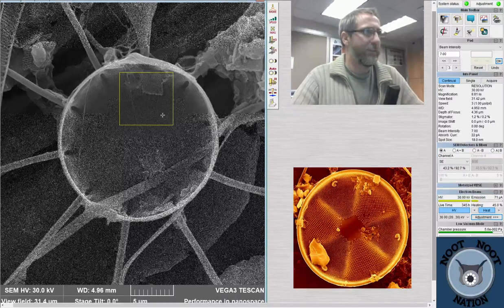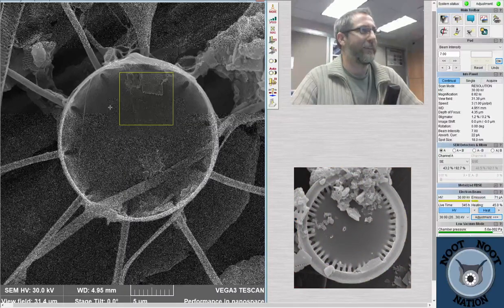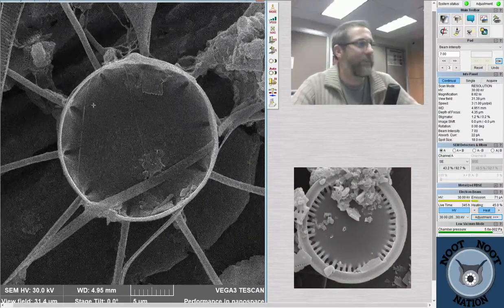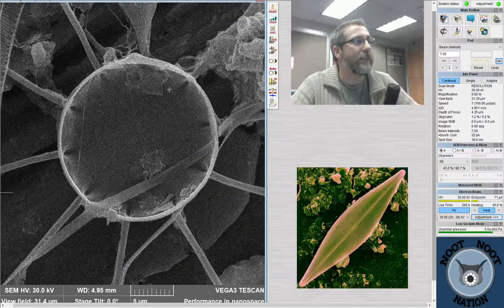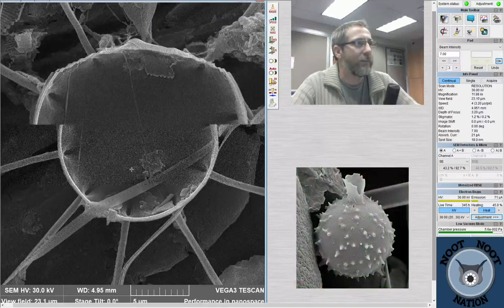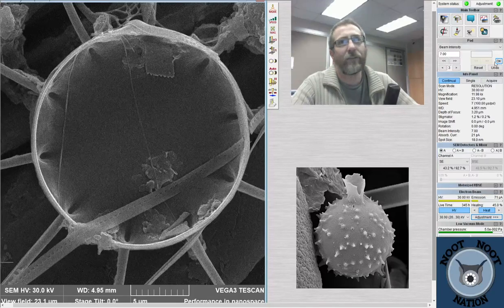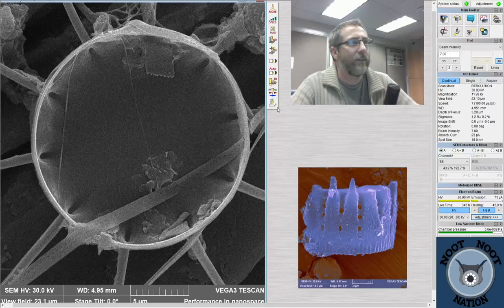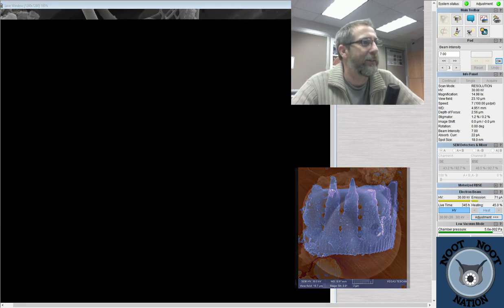So, just try to play with that focus edge a little bit. You know, as a photographer, I'm never really happy with focus, no matter what. But I think this one will probably get enough of it in focus. You can see some of the structure on the valve face, so I'm going to just come in a little bit. And then we'll get a nice photo of that. There we go. Clock-like structure. And also that will let me catch back up again.